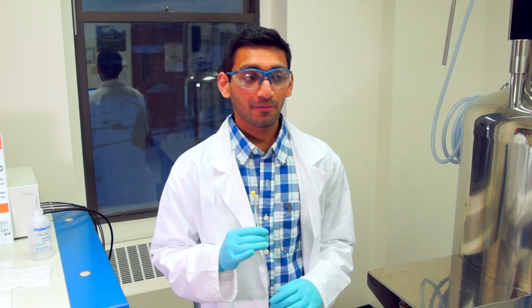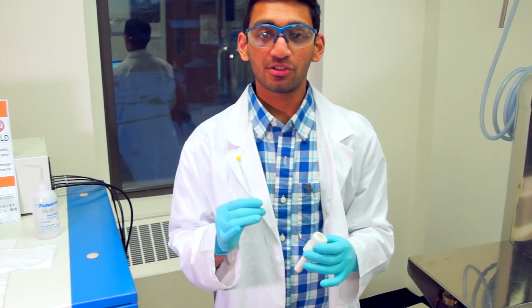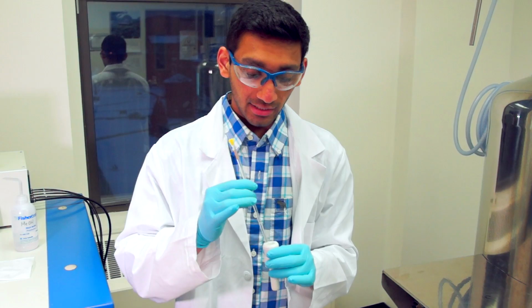Now that you have your NMR sample, you're going to want to have it read by the NMR machine. First, take the spinner turbine and place the NMR tube inside gently but slowly, as the glass is very thin and fragile.